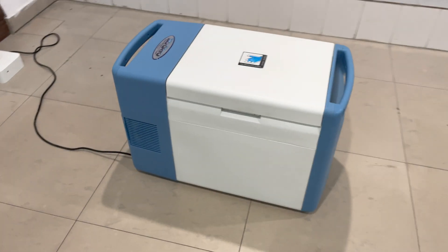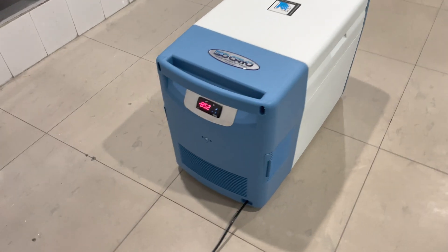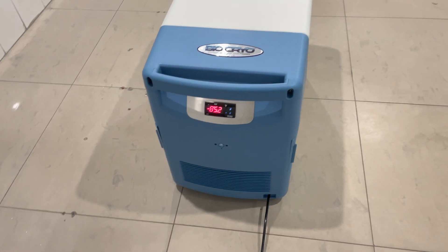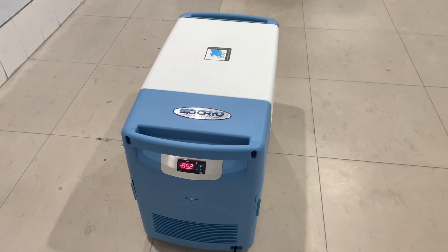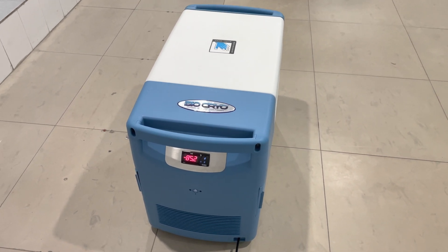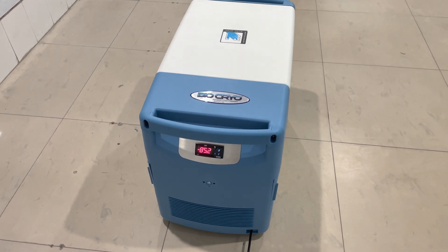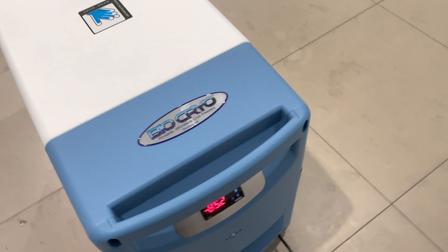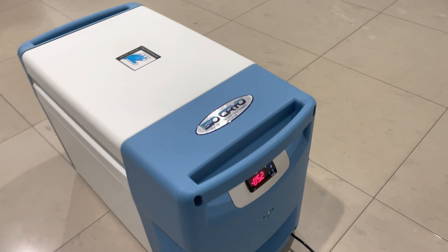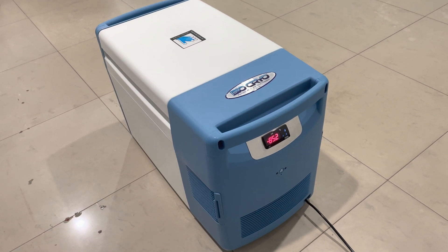It's an attractive unit — reliable, lightweight, and it gets very cold very fast. It's available for only $54.95 with domestic shipping included, which is thousands less than our competitors. We're willing to keep them in stock for so long, so call us ASAP.